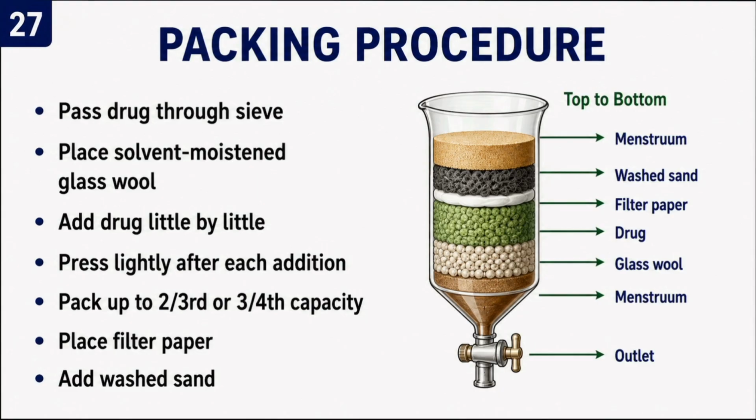Why add drug gradually? Because dumping the entire powder at once may produce uneven packing. Uneven packing means uneven solvent flow. Uniform packing gives a better extraction here.